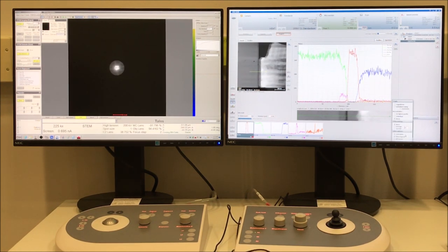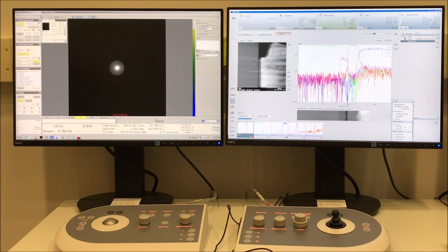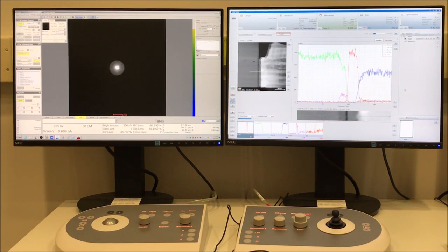Some things we can do here: if you expand that little settings button on the bottom right of the composite line scans, you can do some smoothing to the line scans to make them look smoother, of course. This works better the more points you have in the line. At some point, you start to artificially smooth things out. You can change the y-axis to make it logarithmic instead of linear. I tend to like it just in its raw state like that, but that is one option you have to process it if you wish.